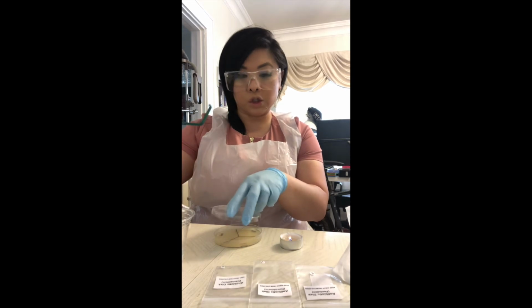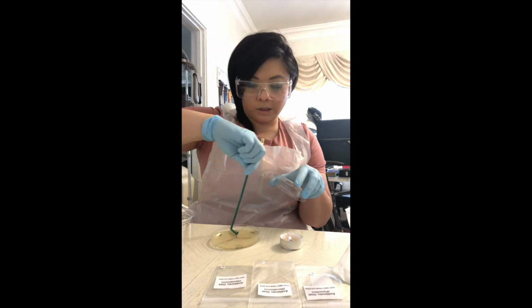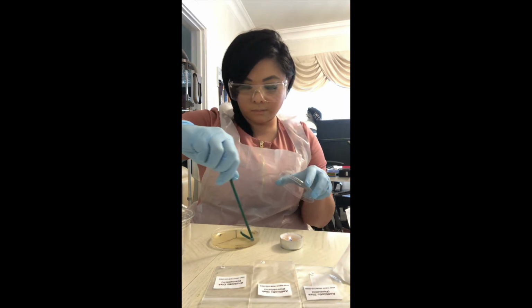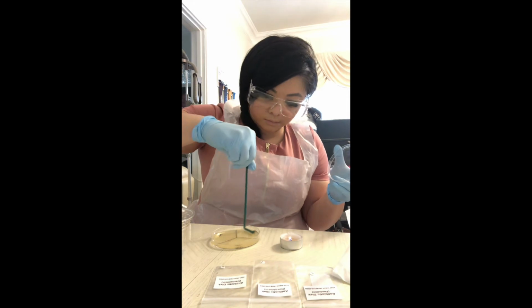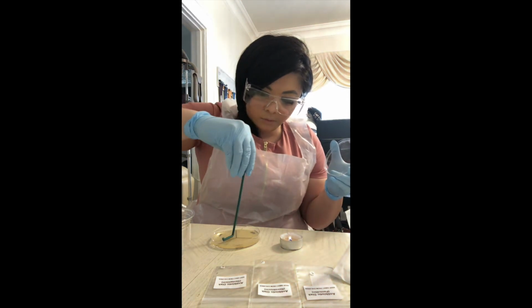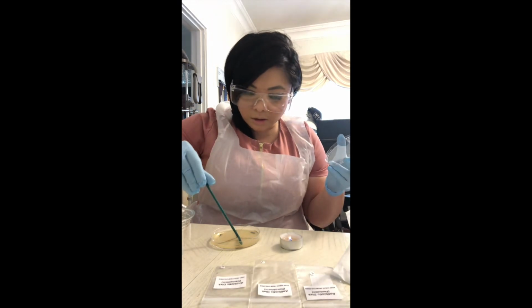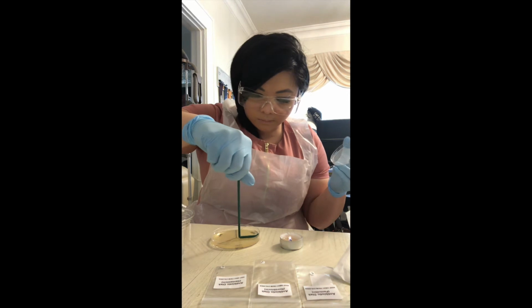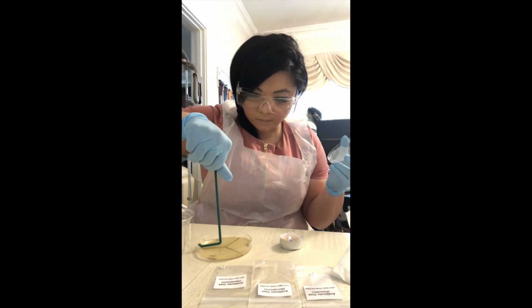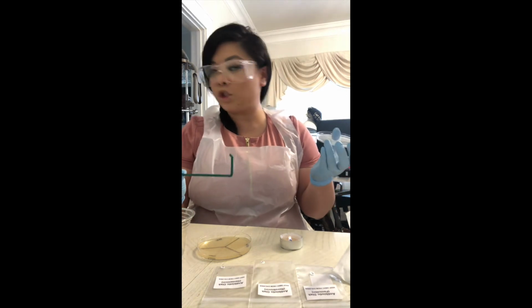And I'm gonna use it to spread the broth around the agar plate evenly. Doing this so the bacteria gets all around the agar plate. Then I'm gonna place this in the bleach.